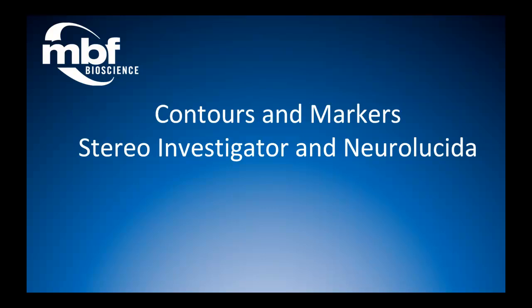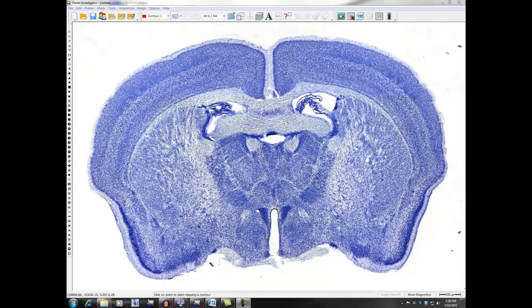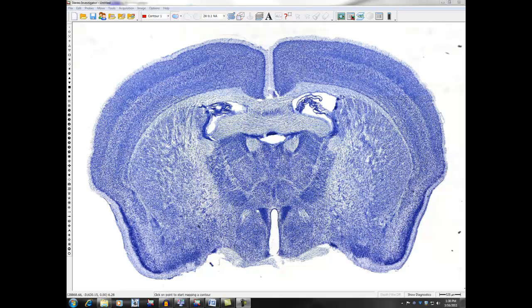Contours and Markers in Stereo Investigator and Neurolucida Version 10. Markers and contours are useful tools in data collection. Knowing how to edit their appearance makes it easier to display them for your specific needs.